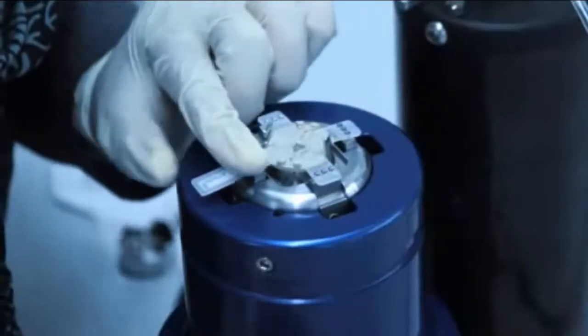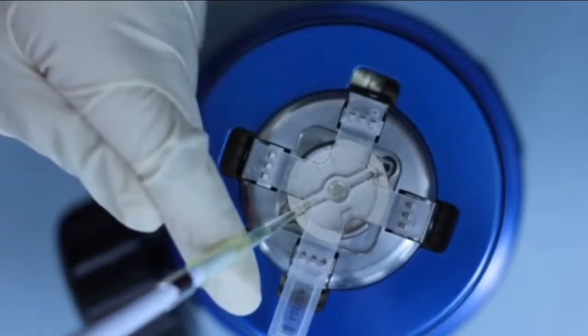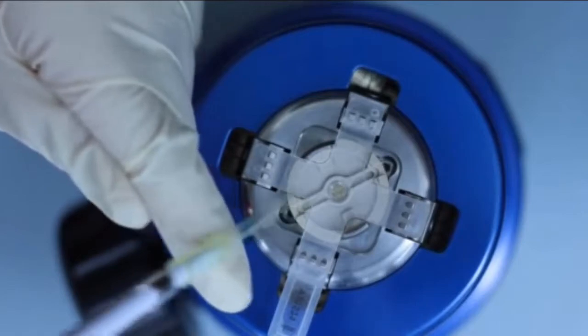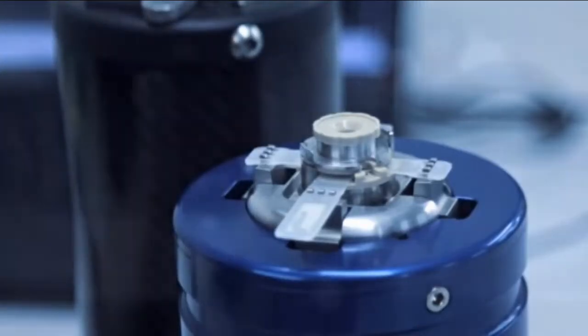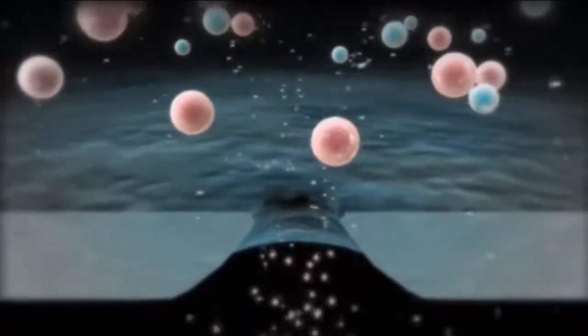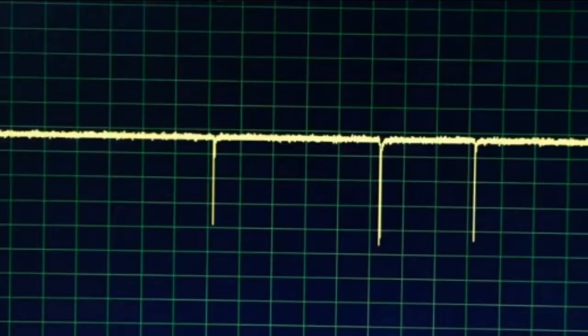A nanopore is attached to the instrument and electrolyte solution is added to either side of the pore. Ionic current flow through the pore is monitored and displayed on screen. 40 microliters of sample is loaded into the upper chamber of qNano. When particles cross the pore, they block the flow of current, resulting in a blockade signal.